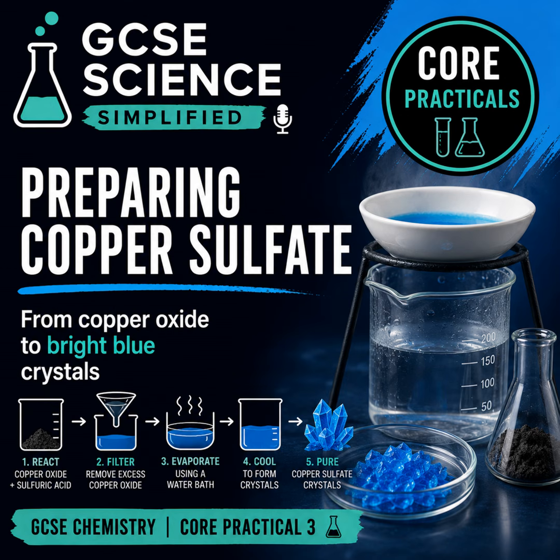And here's the important point. Why not evaporate all the water when we're heating it? Because the crystals need time and space to grow properly. If you were to remove all the water, you just get a powder and not well-formed, nice, pretty crystals. So, what should we notice? The solution turns blue. That's the copper sulfate salt in there. The black copper oxide remains when it's in excess, and we need to clear that using filtration. Then, our crystals form as the solution cools and the water evaporates slowly.